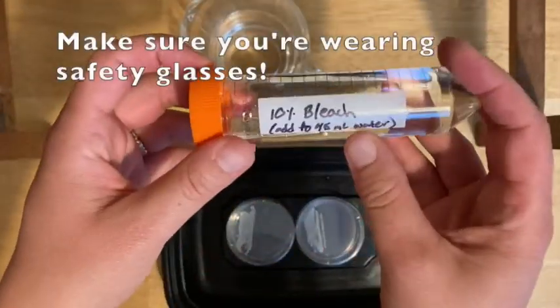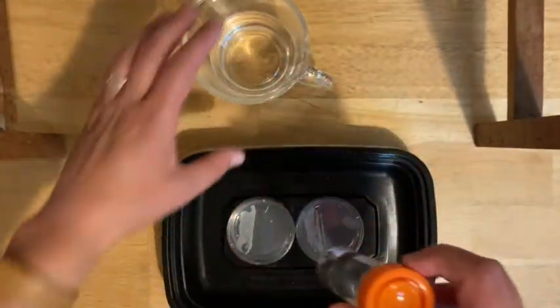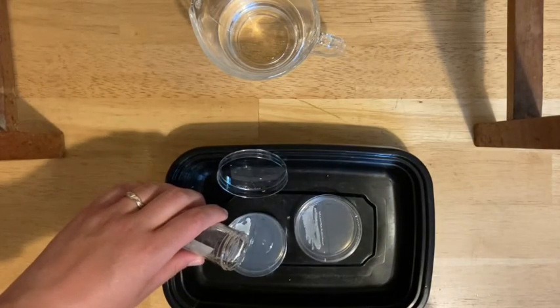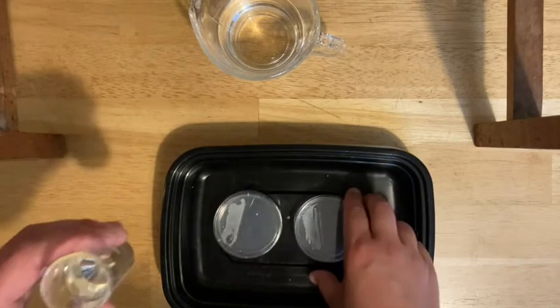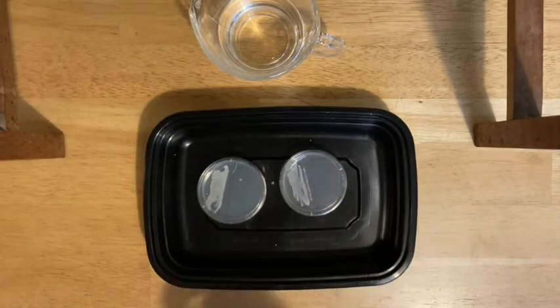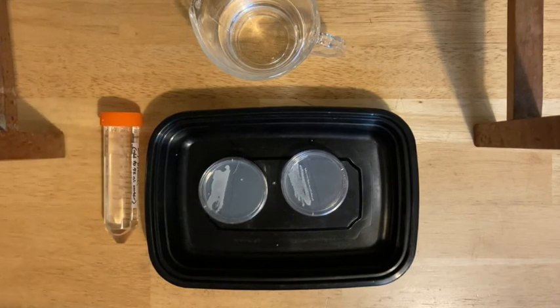Ten percent bleach is a little less dangerous than undiluted bleach, but it can still mess up your clothes and hurt your eyes, so be careful. Open your plates one at a time and cover the surface with bleach — just enough to cover, so be careful not to overflow it. Close each one back up. Do the same for the next one. Let these sit for at least 15 minutes, but more like an hour is better. Then they should be pretty sterilized — even if there was something weird growing, it's all fine now. Go ahead and drain them in the sink and throw them in the trash. Wash your hands after doing this just to be safe.